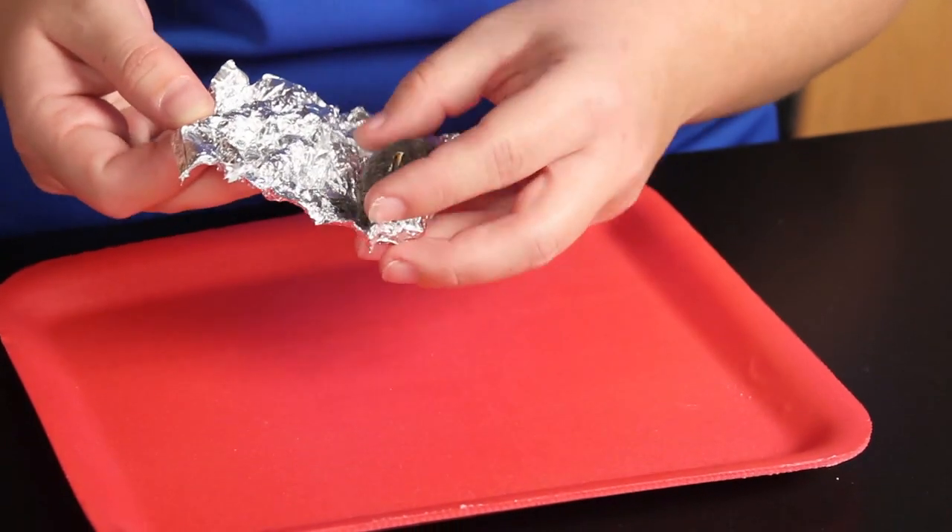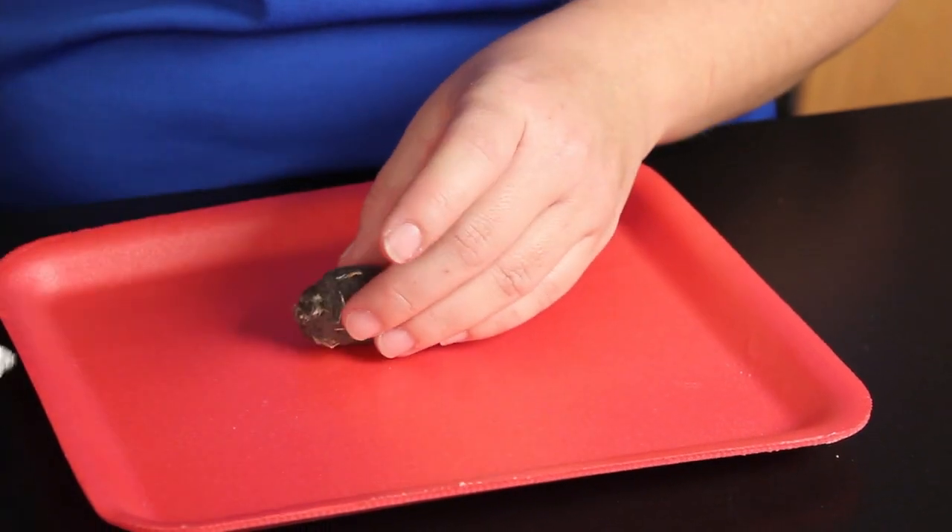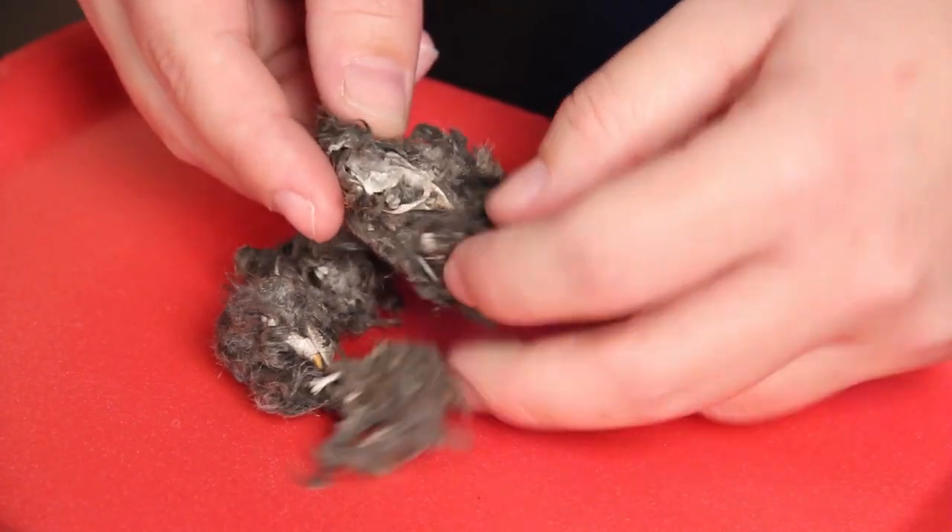Unwrap the owl pellet carefully. Take notice of the color, size, and texture of the pellet.